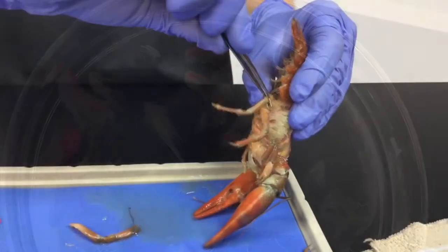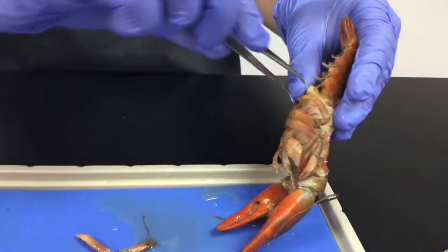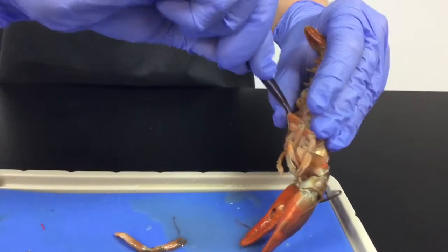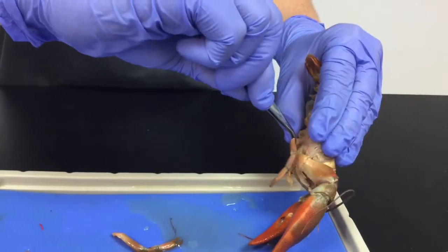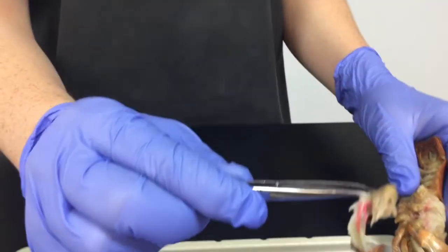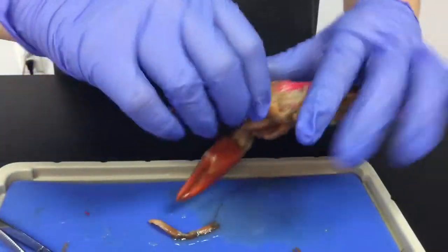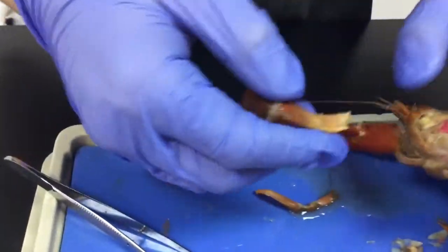For better handling of our crayfish, we're pulling off the legs. Ethan is really loving this part. And we're also removing the rest of the gills. You too could have had this joy. Susanna, I know you're loving this. Ooh, he got some gills with that leg. Look at that. Oops. It's okay. You can pull off the pinchers too, the claws. He's gonna become a chef in life. Just kidding.